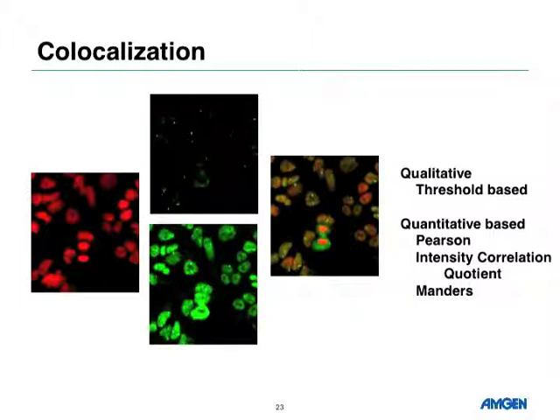But that's very dependent upon the scaling and the thresholds. And so we usually choose not to use that kind of qualitative method, but actually use quantitative methods like Pearson's correlation coefficients, which are not influenced by these threshold cutoffs as much.